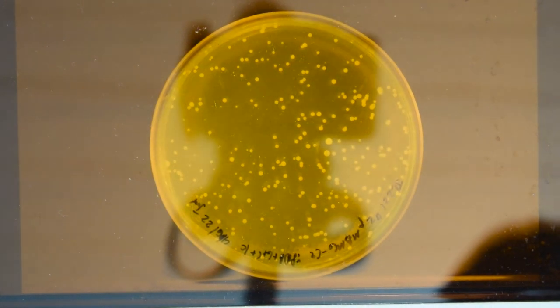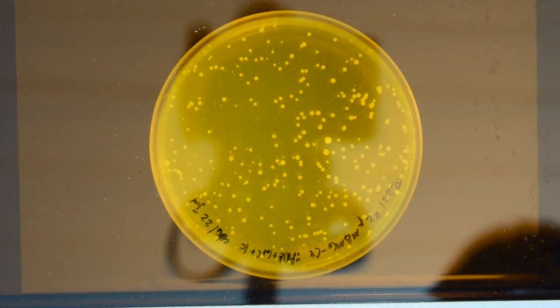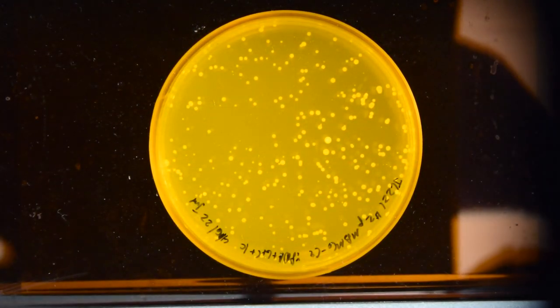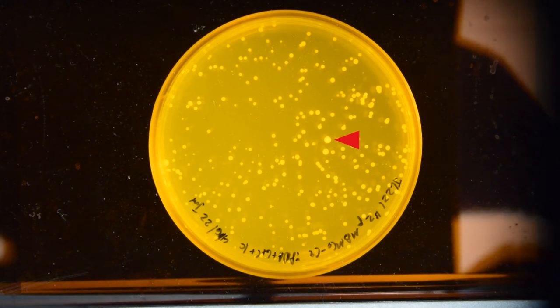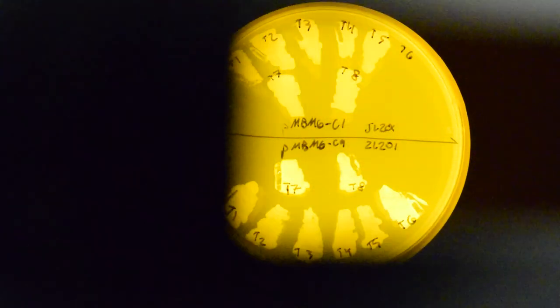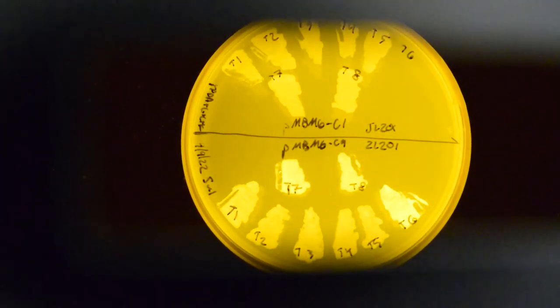The construct I am using shows best after plates are moved to 4 C for 1-2 days. I am using LSSmOrange, a fluorescent protein visible on a blue light transilluminator with an orange filter. Bright colonies in this case are likely positive transformants, which can then be confirmed with a PCR screen.